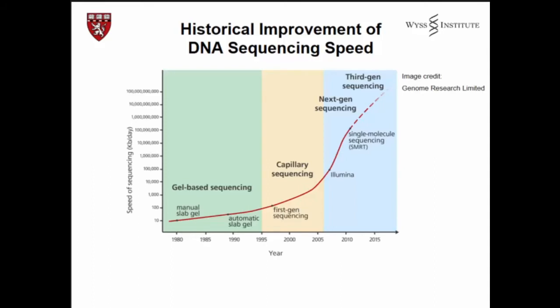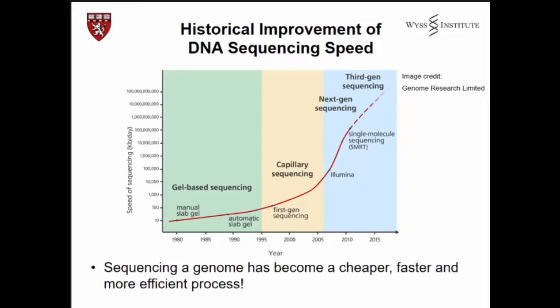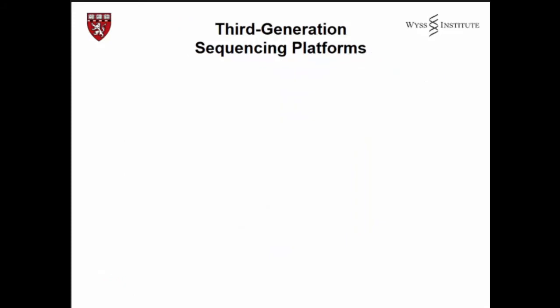So when we look at the historical improvement of DNA sequencing speed, it follows an exponential increase. Similarly, when the 3rd generation sequencing devices, these nanosensors, CMOS integrated circuit sensors, are introduced, you can see that the speed magnificently increases. So what I'm trying to point out here with technology development and CMOS sensors, integrated sensor technology, which is currently being developed in cell phone and computational chip technology, is that it will enable genomic analysis in a more affordable way.